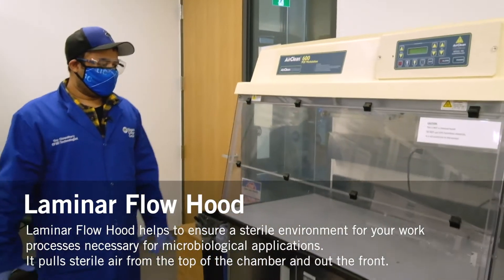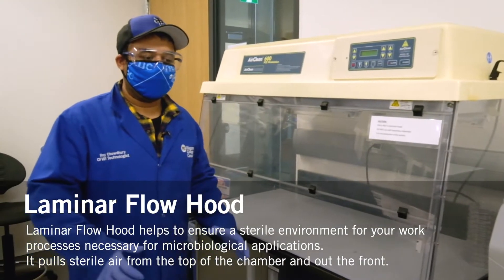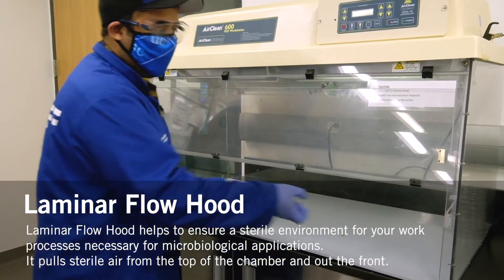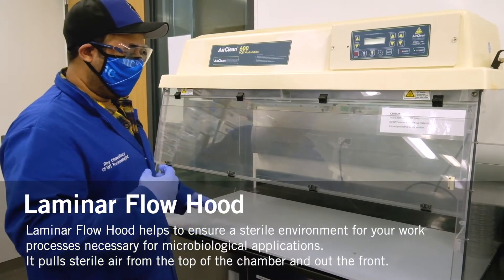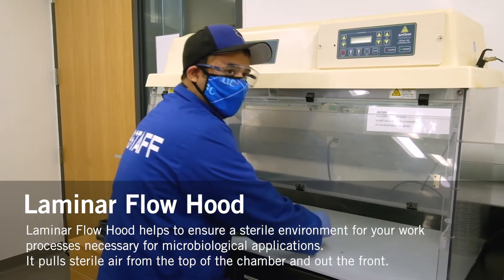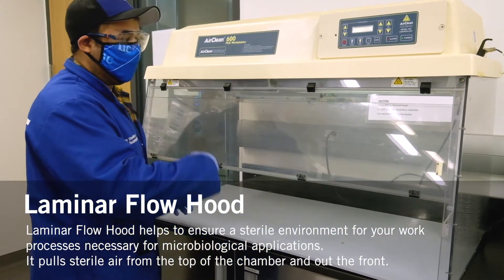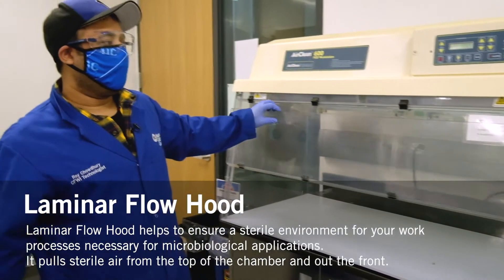This is the flow hood. Students tend to work in here. As you can see there's light, and if they're trying to work in an aseptic field they would work in here. There's airflow which you can turn on by turning the fan on. The moment you open the door there's a constant airflow, which prevents any kind of outside air from getting into the place you're working in. If you're trying to streak a plate in this laminar flow hood, it creates an aseptic field for you, so environmental factors that might contaminate your microorganism plate won't happen due to the airflow.